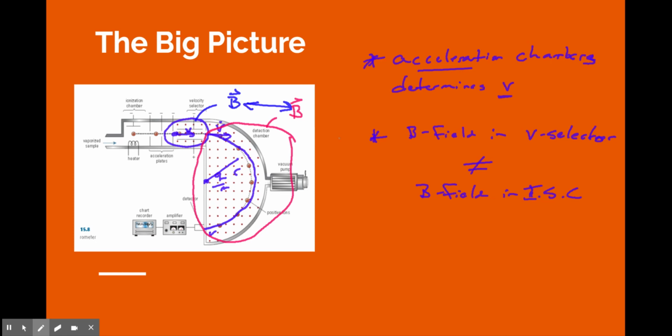For example, the military might use mass spectrometers to identify a sample from a chemical plant that they think might be creating chemical warfare agents. In the end, you get a chemical fingerprint on a chart recorder of whatever happens to be in that sample. So even if it's mixed up and muddled up, we can figure it out.